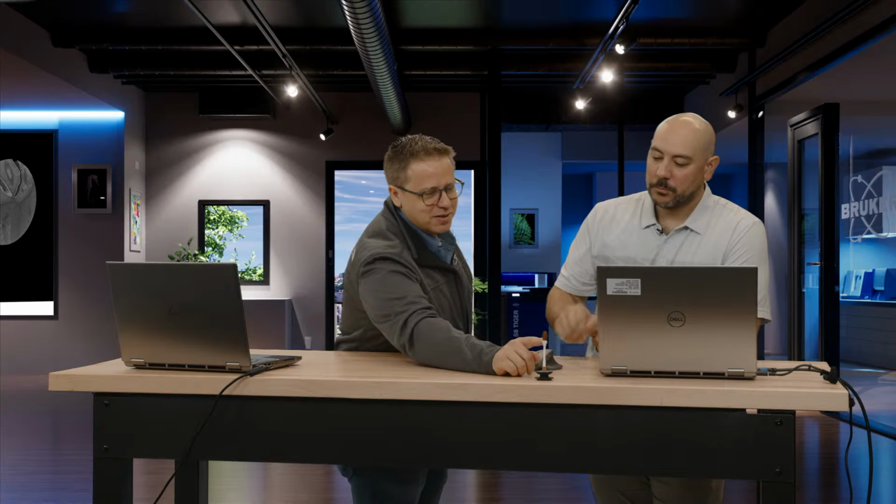You're probably looking at the size of the rock. If it's a smaller rock, like almond size, it's a chunk of limestone. Billy's a geologist, so we got to say the right words. I would start at 80 or 90, but it could be lower depending on how compact and how dense the sample is. But I would say 80 is a good starting point, and then you would adjust accordingly.